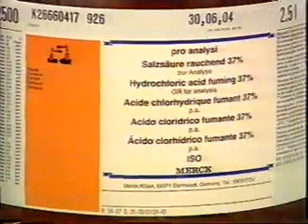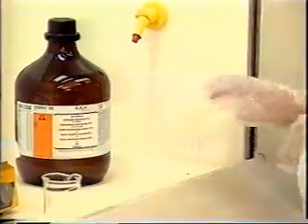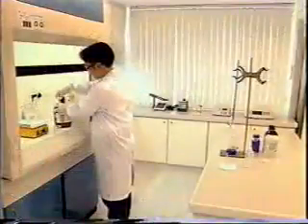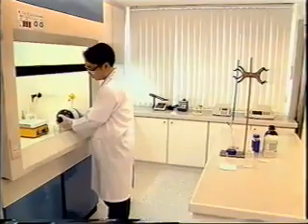Wear proper footwear. Shoes must have a solid sole and must enclose the entire foot. When working with hazardous chemicals, in addition, gloves have to be worn. Make sure that the material of the gloves is suitable for the chemicals you are handling, as some chemicals can penetrate unsuitable glove materials easily.